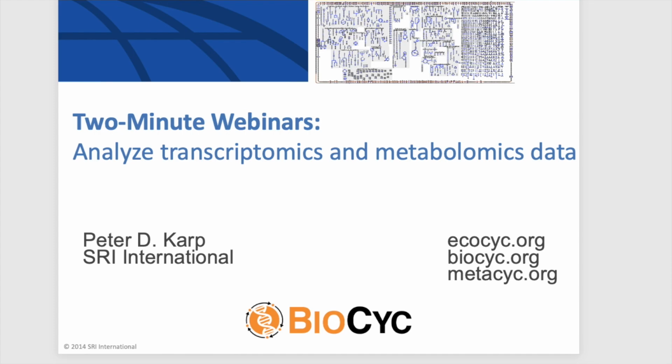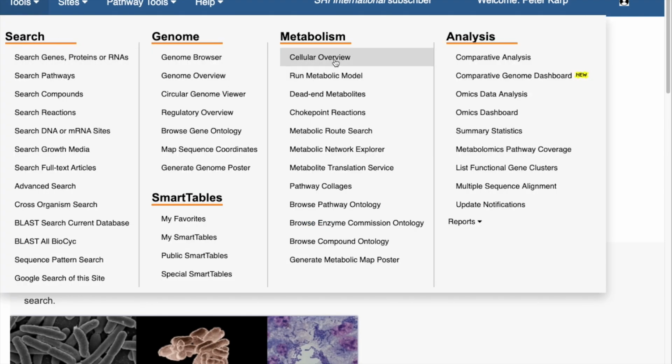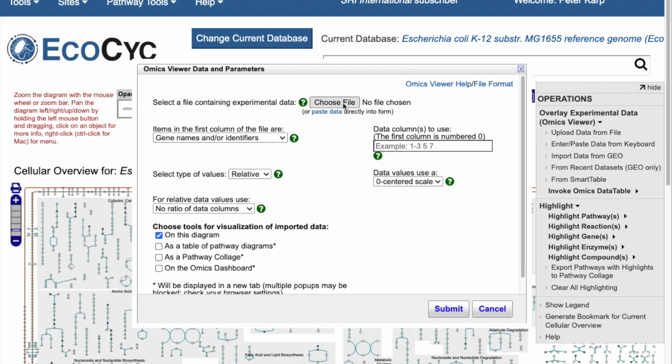This webinar will give you a taste of analyzing transcriptomics data in the limited time, and the same tool can be used for analyzing metabolomics data as well. We'll start at the home page for EcoCyc, the E. coli database, and go once again to the cellular overview, the metabolic network diagram. And we're now going to upload a transcriptomics data set from a file.